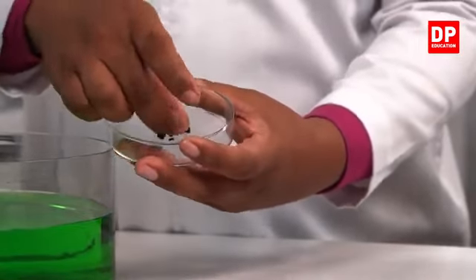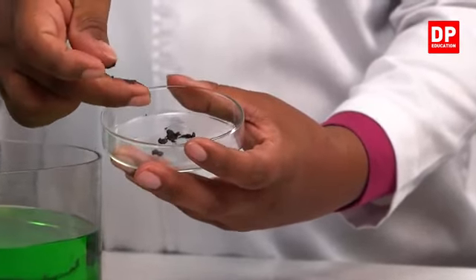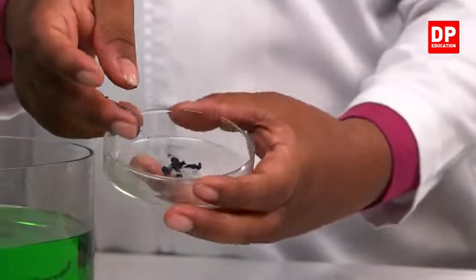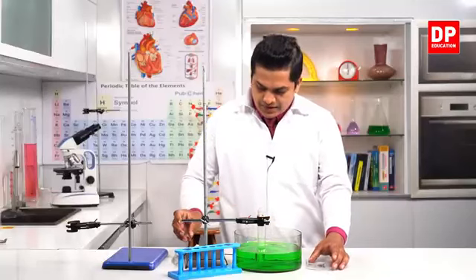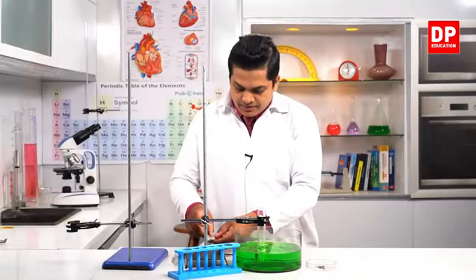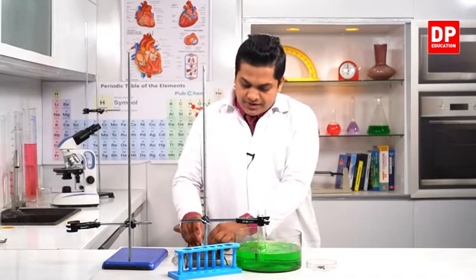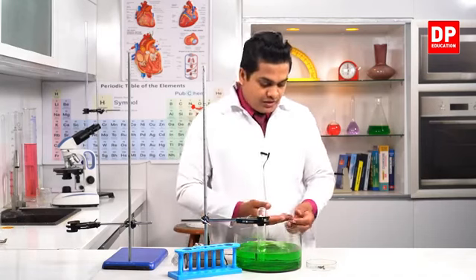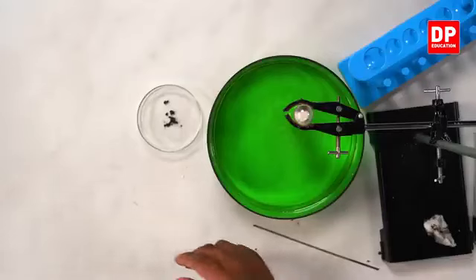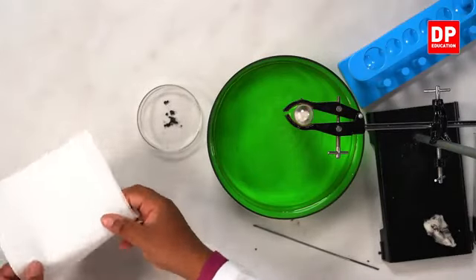So the iron powder has some amount of rust. I'll use a white color background to show it to you, a tissue paper.